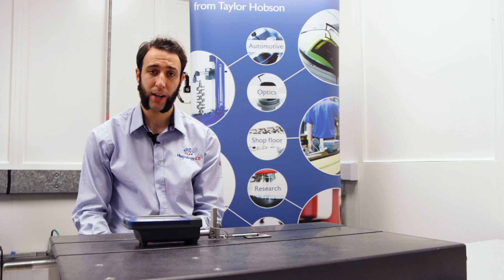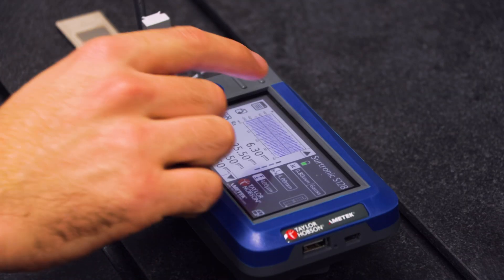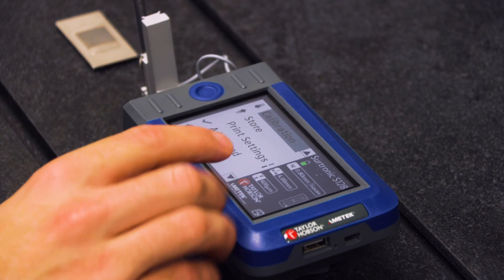We are going to demonstrate these key features now when carrying out a calibration. To perform a calibration, enter the menu and select calibration.